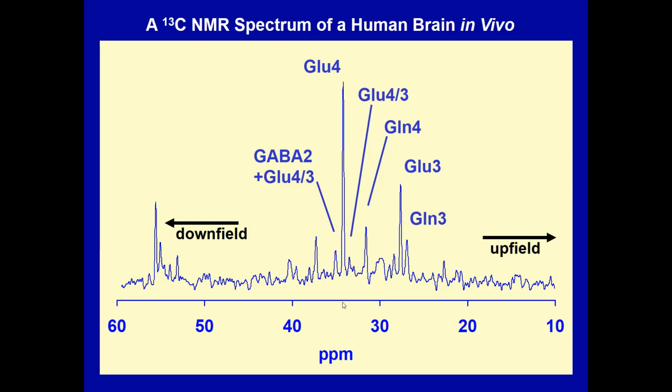Now, something else that Robin mentioned is an oddity. I've seen even experienced people forget this and get confused. There are two things here that are strange. Notice that this graph on the right has lower numbers than on the left. Almost all presentations of spectra have the higher numbers on the left. And to make things even more confusing, that's downfield, even though the numbers are higher. And that's historic.